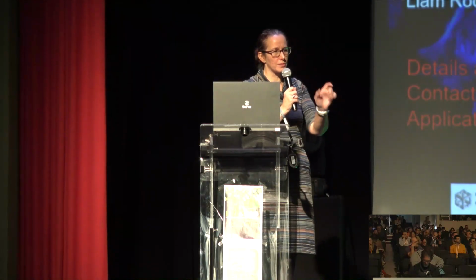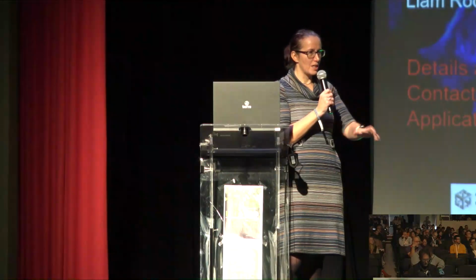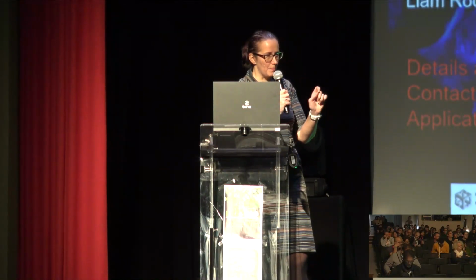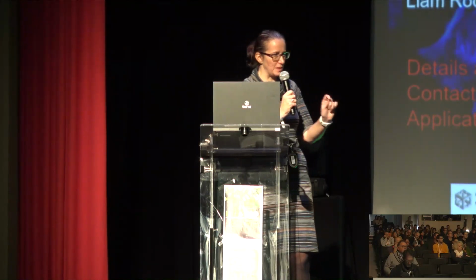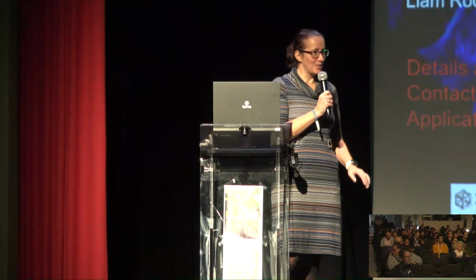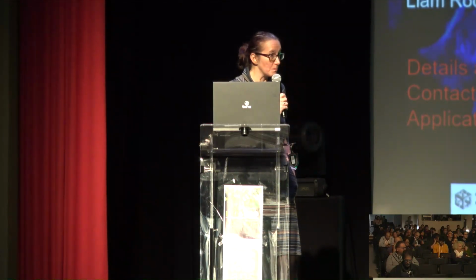I'm glad that you've noticed that it is 4.5 watts, but it's across 4.5 millimeters. So overall, the photon density is low. But I think this is speaking to the fact that there is something going on. We don't know what it is. So maybe we should chat later, because we just don't know.